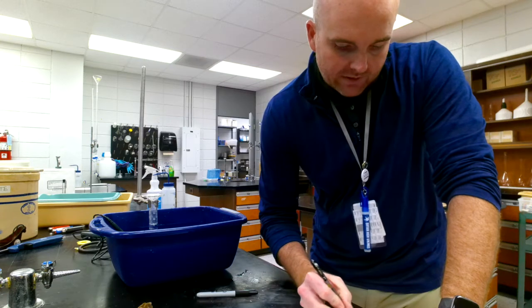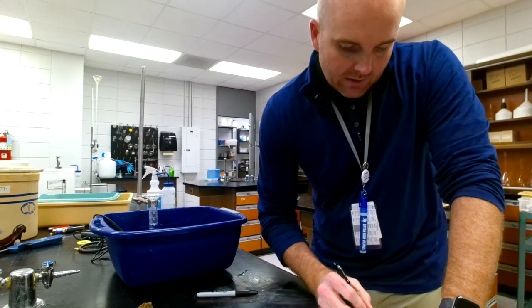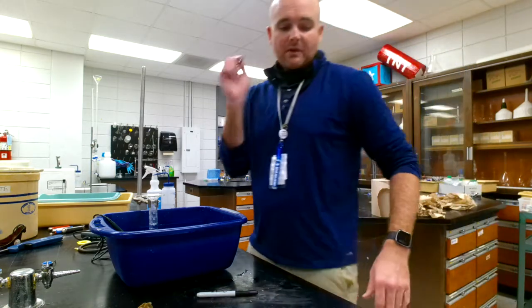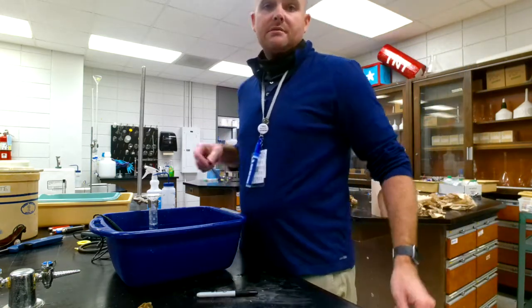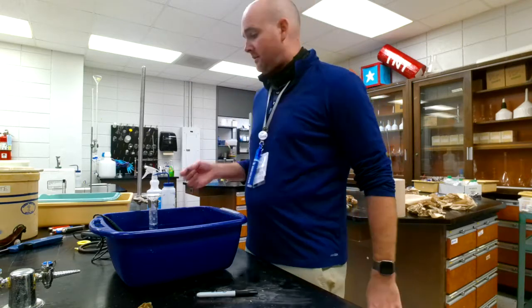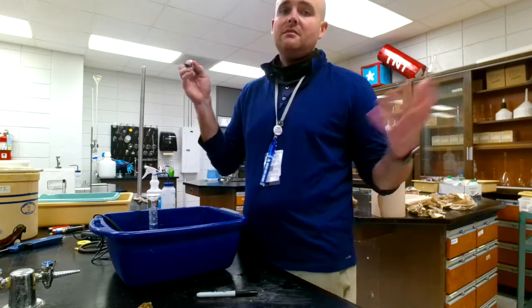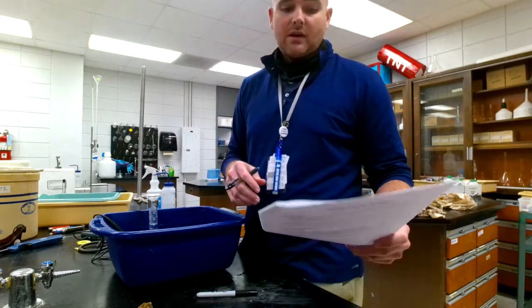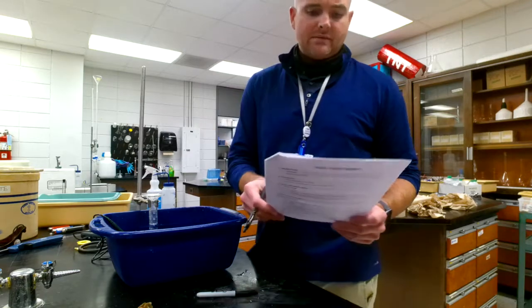Another reason why we're not doing uncertainties right here is because I have no idea what the uncertainty of the pressure is, and the uncertainty of your temperature is going to be so wide that it's going to envelop everything else. So yeah, we're just not going to mess with that.